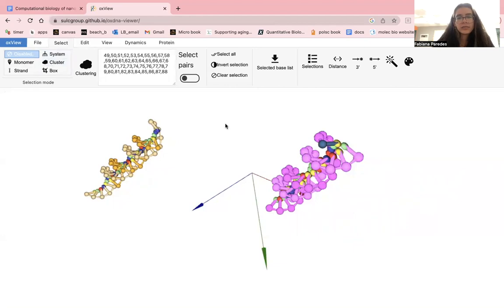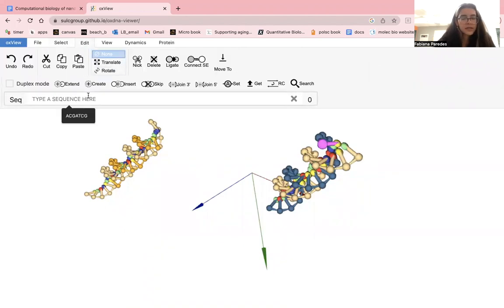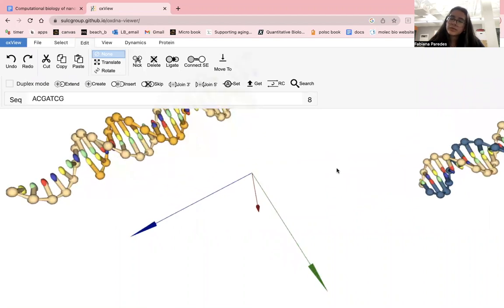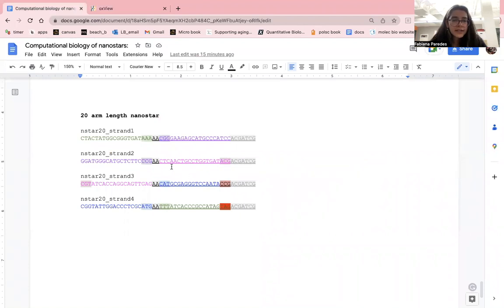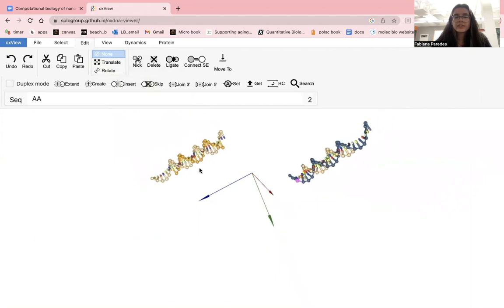Select, disabled. Okay. Select monomer, G. Edit, copy and paste, accept. Perfect. Now I did. All right. And then we can do the spacer. Zoom in. Should be a double. Oh, wait, what am I saying? It should be at the CTC. And I think it was the blue one, right? CTC. Yeah. So we click on it. We do double A, extend. Perfect.